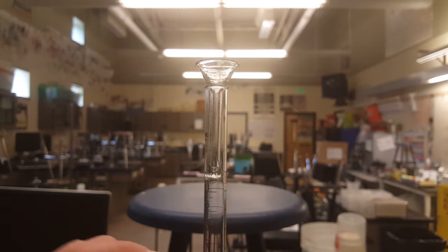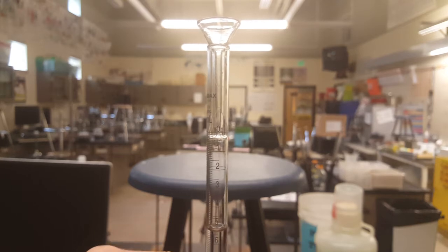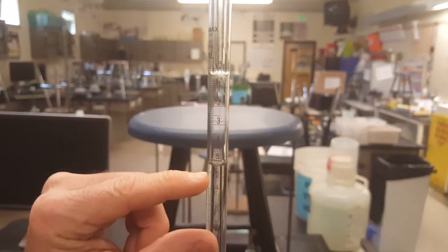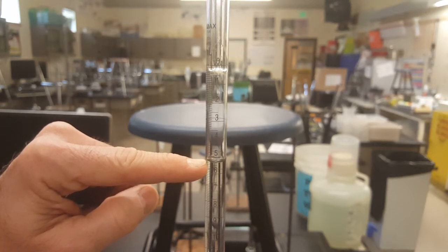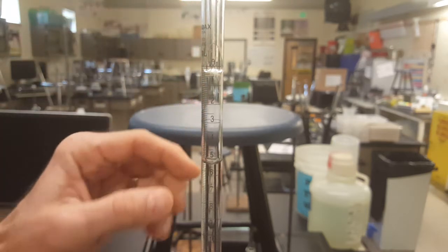You can see the measurement here at the bottom of the meniscus. There's a 5 on top and a 6 on the bottom. So you need to be really careful. This value here in between 5 and 6 is not 6 point something. It's 5 point something. You have to read burettes from the top toward the bottom.